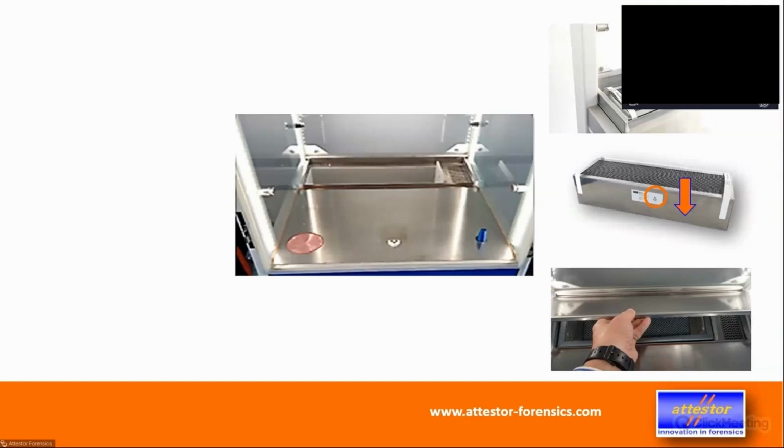Most of our labs here are using peroxide solution, so between 8 and 12% solution. He basically had a spray pump, and he was spraying everything inside with this peroxide. And he sprayed so much that everything was running down on the walls and dropped down from the ceiling. So if you bring peroxide into your activated carbon, and then later on a blowout actually distributes that peroxide across your evidence, that's the perfect way to eliminate all the DNA on your evidence, which you probably don't want. So for that reason, we have a cover baffle that comes on top of it.